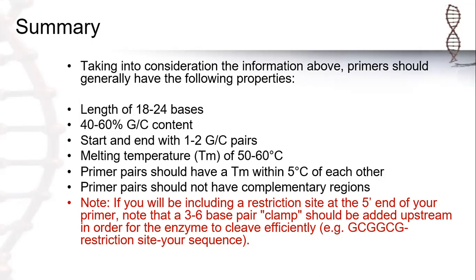from the PCR. If we are still not getting the PCR primers annealing with the target DNA site, then you should look at these primers again, and you can design them again carefully, and you can use Primer3 or any other tools.